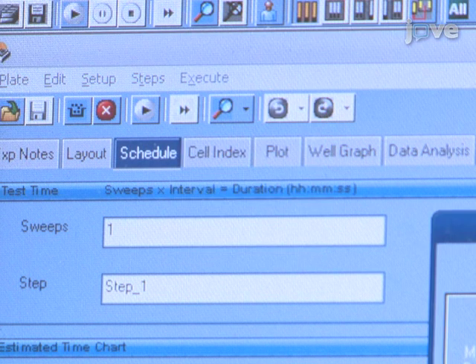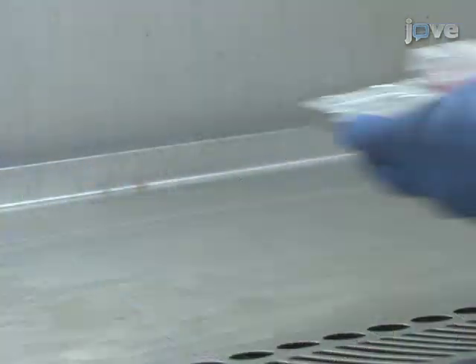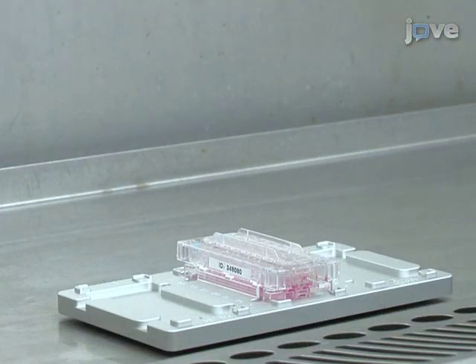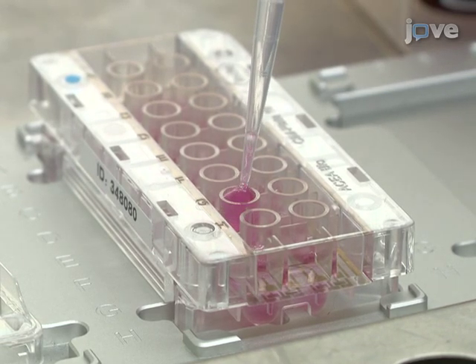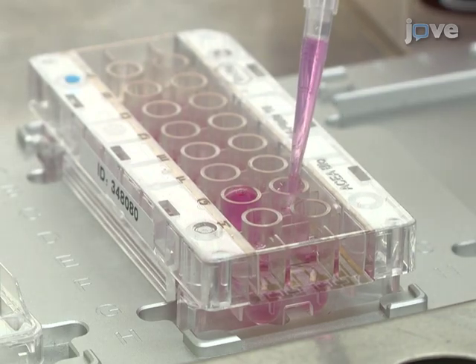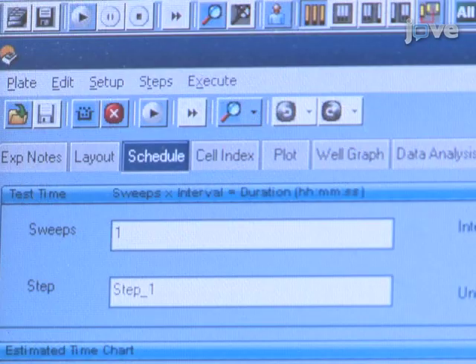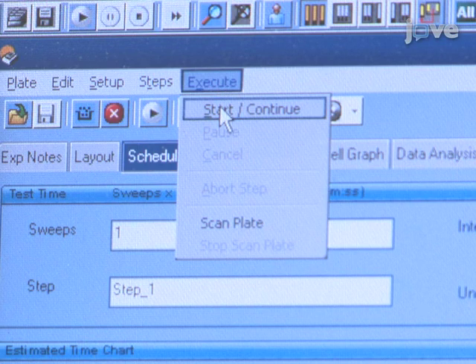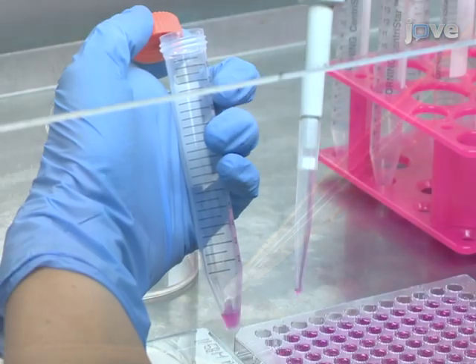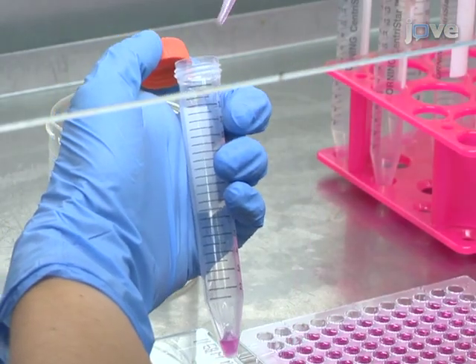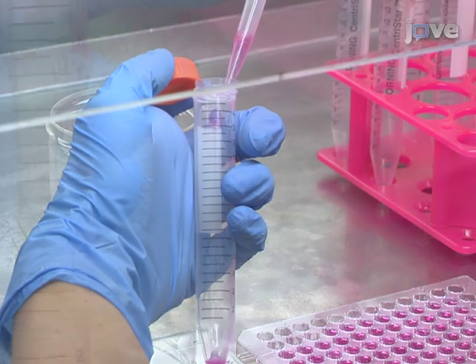Select Execute in the menu bar and then Start. A background sweep will automatically be performed. Following the background sweep, remove the CIM plate from the instrument and place it in a tissue culture hood. Plate 50,000 LP9 cells suspended in 160 microliters of serum-free medium into the upper chamber of each CIM plate well. Place the plate in the RTCA instrument and take readings every 15 minutes while the LP9 monolayer is establishing overnight.